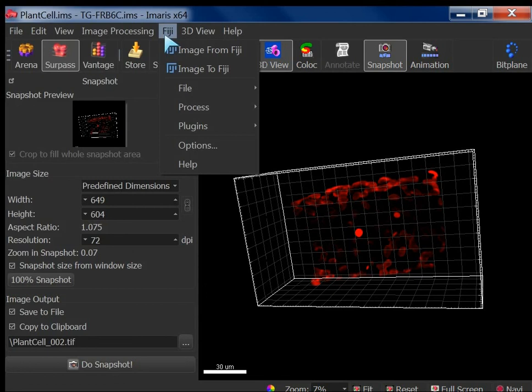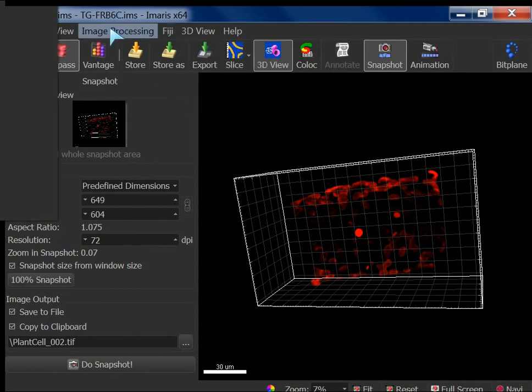We can create all the settings, and then you just have to call a function from here and say run this function. It will run all the pre-processing steps, so you don't have to do it manually. Of course, you have to be consistent for all the datasets. If you keep on changing the background subtraction, then okay, it's possible. But that's possible. Good. We'll cover that next.